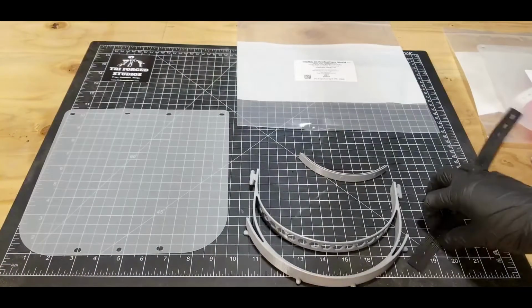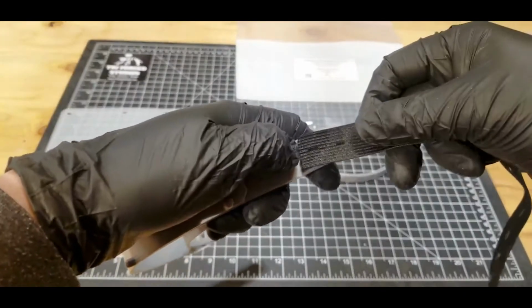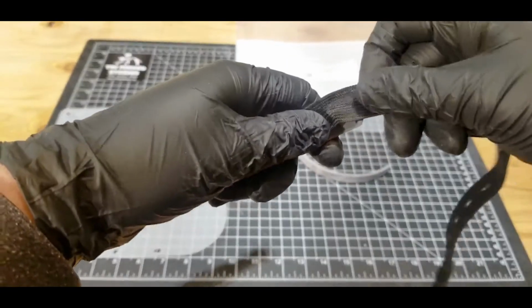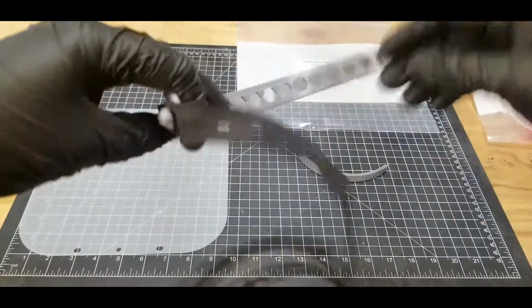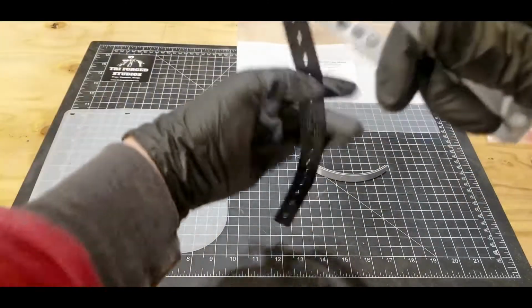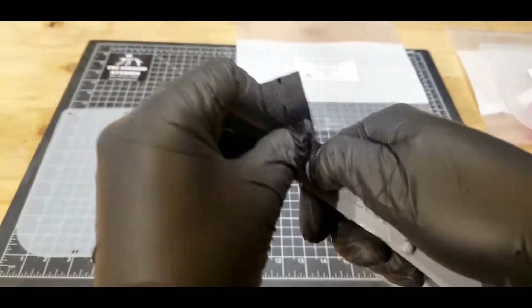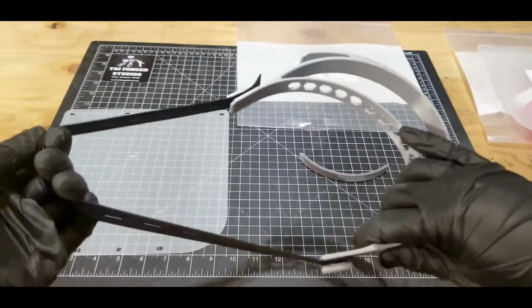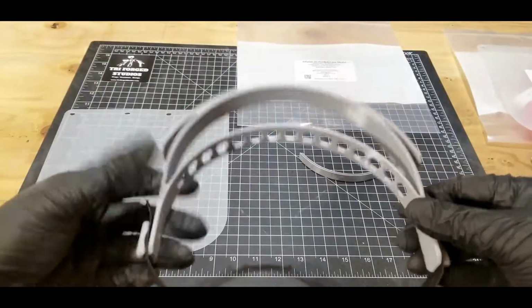The first thing you want to do is grab your elastic band and your headband. The easiest way to do it, I would say, is to pick a spot here, anywhere you think. I find this is more average, and clip it in like that. And you want to do the other side as well. If you're not sure, you can just do a general size, and you can always change it later. It's very easy to do. And there you go. These are flexible, and they also leave a lot of room.